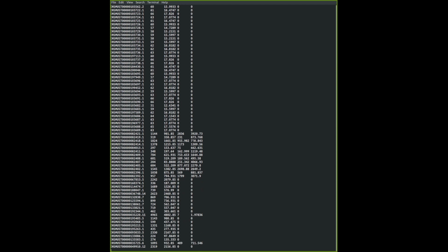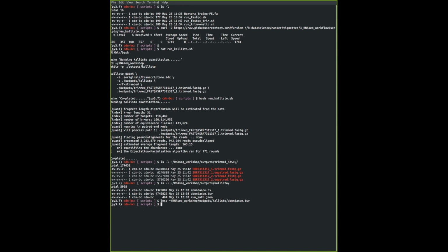And we did get to a very nice ending point here, which is to visually see the output of a mapping algorithm. So if you're gonna go out from less, you're gonna go back to terminal, press Q. Q will exit out from less and go back to terminal, and you can continue on from there. So yeah, this count matrix is again an input to a lot of other downstream analyses, and I think it's a good stopping point for this workshop.